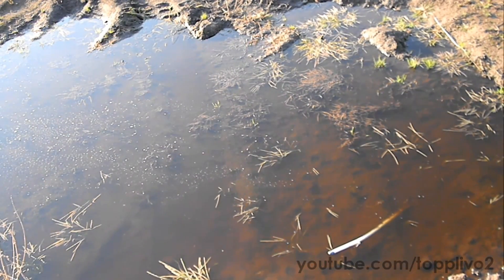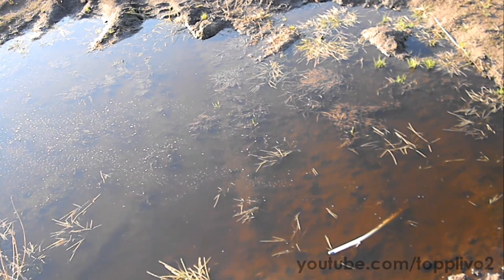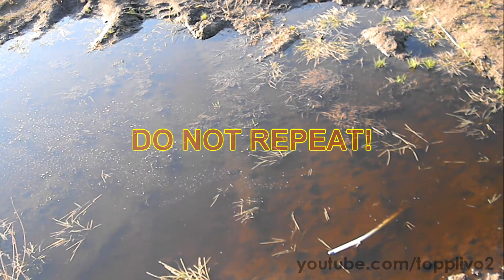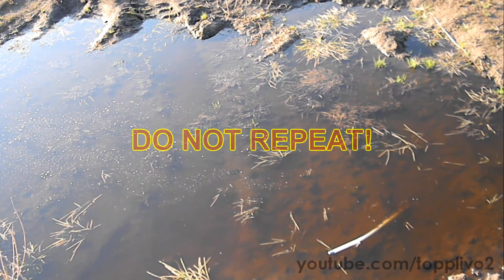Finally, I just can't resist and decide to throw approximately 15 grams of sodium into a large puddle. Don't repeat that experiment yourself because it's very dangerous.